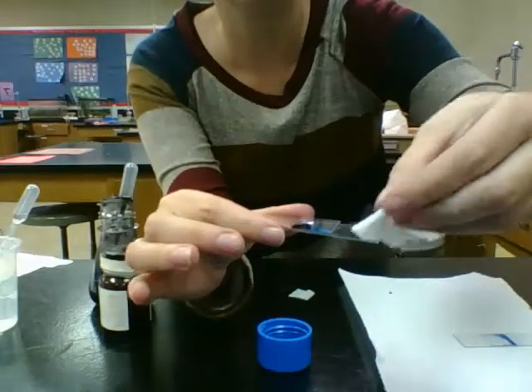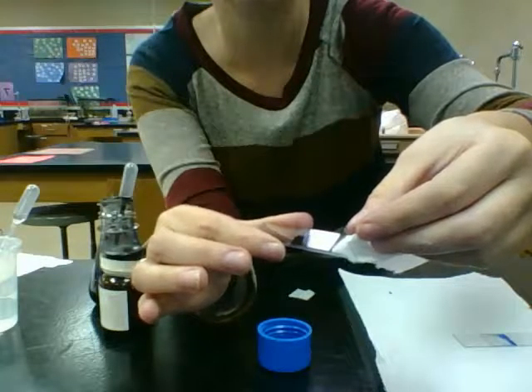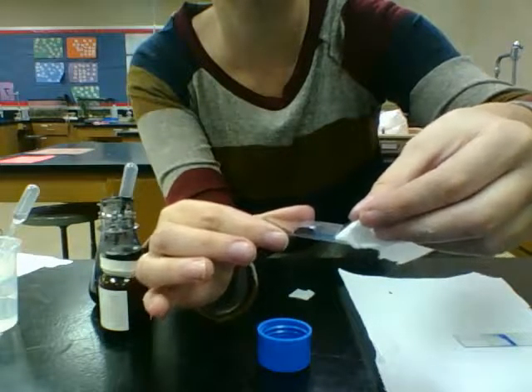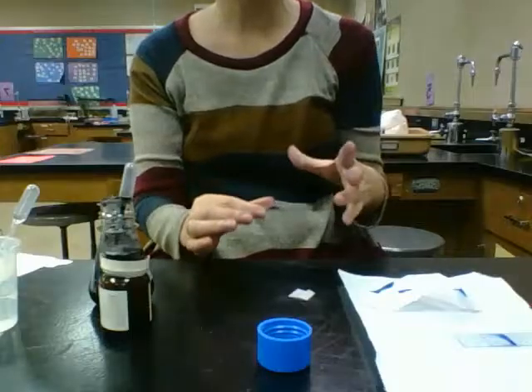Put a little piece of paper towel on the one end, and it will help wick it over to the side a little bit quicker, a little bit more evenly. And it will wick up any extra. Okay? When you are done, if you have too much there, you're going to want to blot off the side of the microscope slide itself so it's only contained underneath the cover slip. If you didn't put enough in there to begin with, you might have to add one more drop.